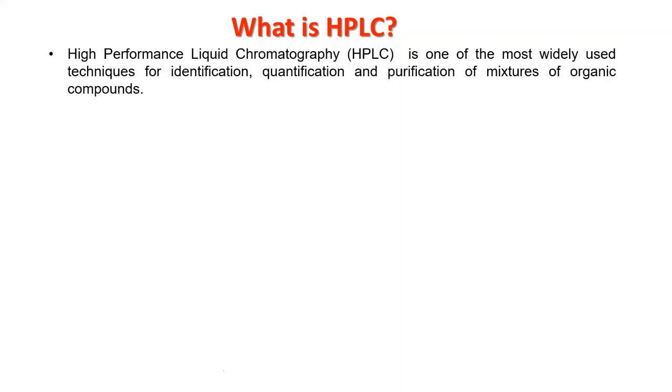It is one of the most widely used techniques for identification, quantification, and purification of mixtures of organic compounds. It's just written organic compounds, but even inorganic complexes can also be separated if they have suitable solubility in different organic solvents too.